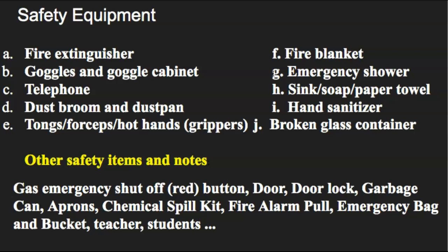For some labs, if we're using chemicals and things like that, you should wash your hands if you think you got anything on your hands. It's a great way to keep yourself safe and healthy. Hand sanitizer, another great way to keep yourself safe before you do a lab. Now realize the hand sanitizer doesn't have the same function as the soap and the water. So you want to be careful with that.